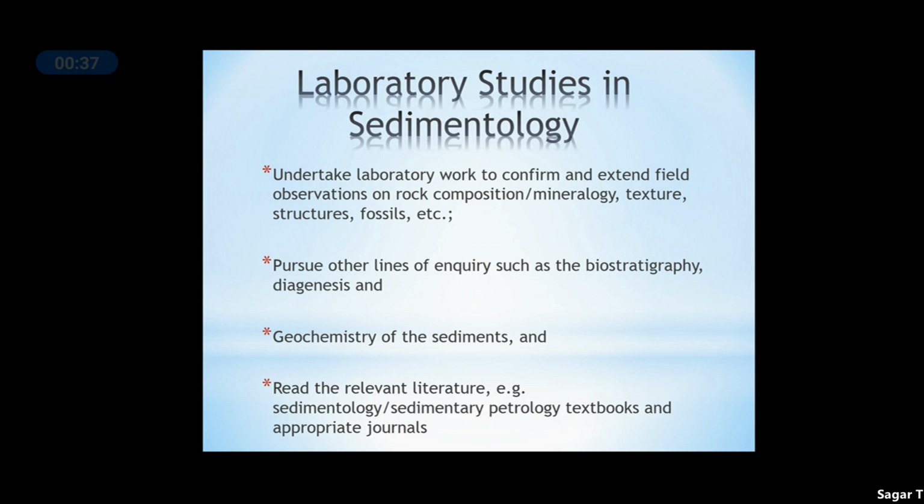Now there are numerous techniques which can be performed in a sedimentological laboratory, and it is a very vast topic and we cannot cover all the techniques which are used in a sedimentological lab. So I'm going to give you a broad or general idea, and then I will mention certain important techniques which are used generally in a sedimentological lab, and I'll give you an overview of certain techniques that I have used myself during my work.